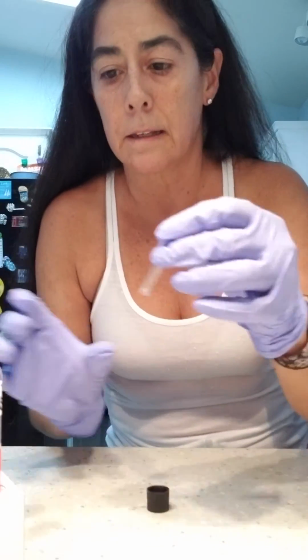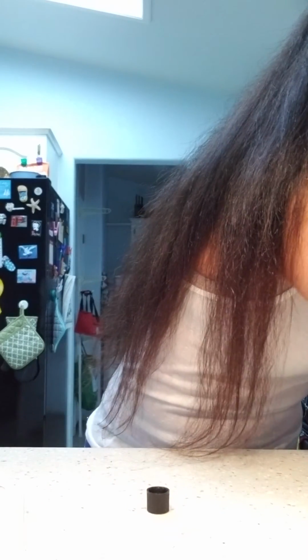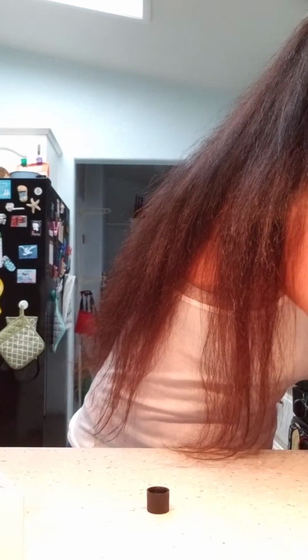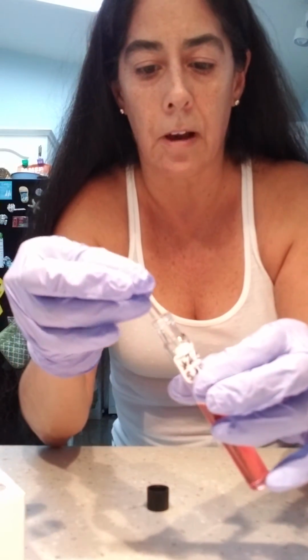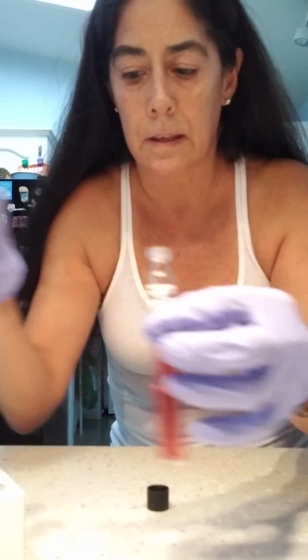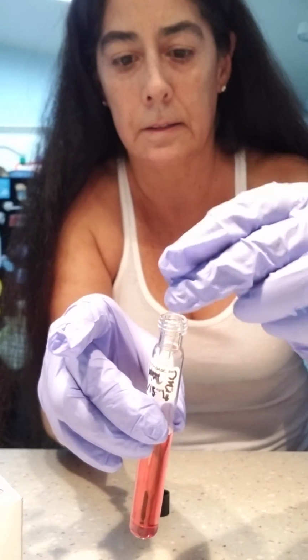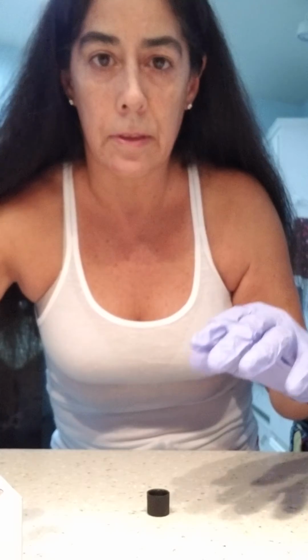So now my next mission is I'm going to put this upside down into each vial, and put another one and drop it in. Okay, so now those are both in with the opening towards the bottom, which is what you want.